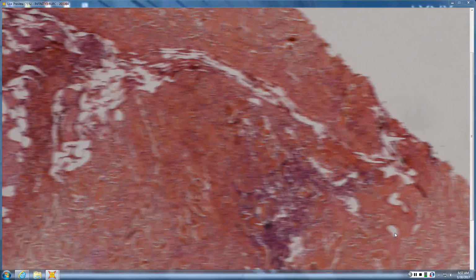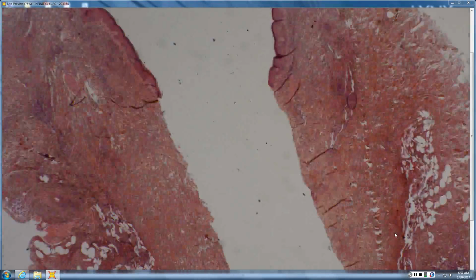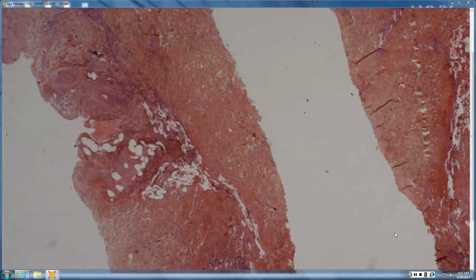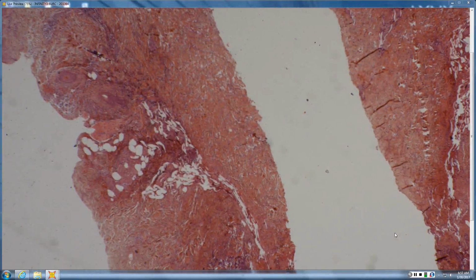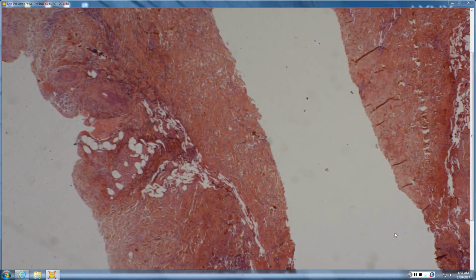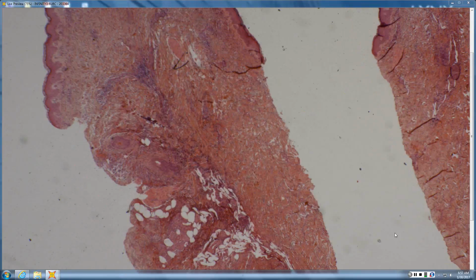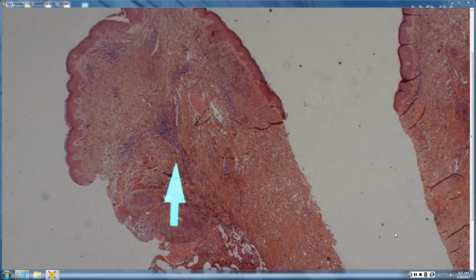So this next case, this is number 2. This is ecthyma gangrenosum. In the derm world, we think of run-of-the-mill ecthyma, and then ecthyma gangrenosum, and there are multiple organisms that can create a similar picture. When we say ecthyma gangrenosum, we typically mean that Pseudomonas infection that's causing a deeper necrosis of vessels. So from scan, it looks like a largely lymphocytic infiltrate. It's kind of perivascular, but it goes pretty deep.